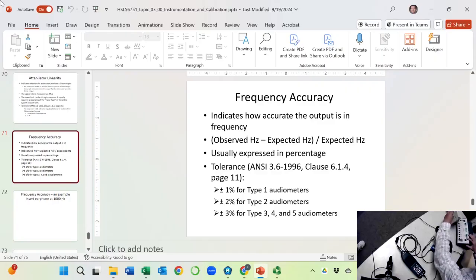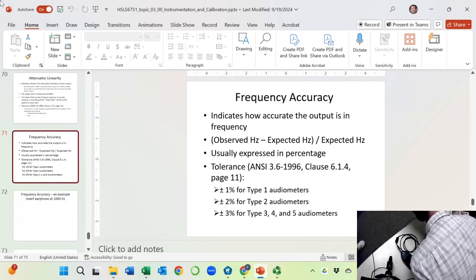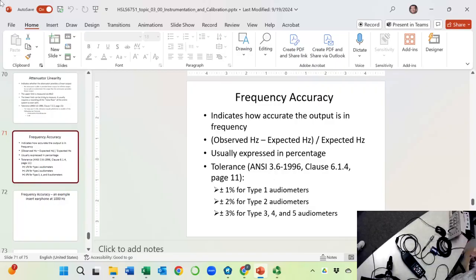Because of the display, you can only see it from a specific angle, and I don't know if it can be recorded. Probably not. So can you see it okay from that angle? Okay, then I will go around it. So let me reset. Alright.